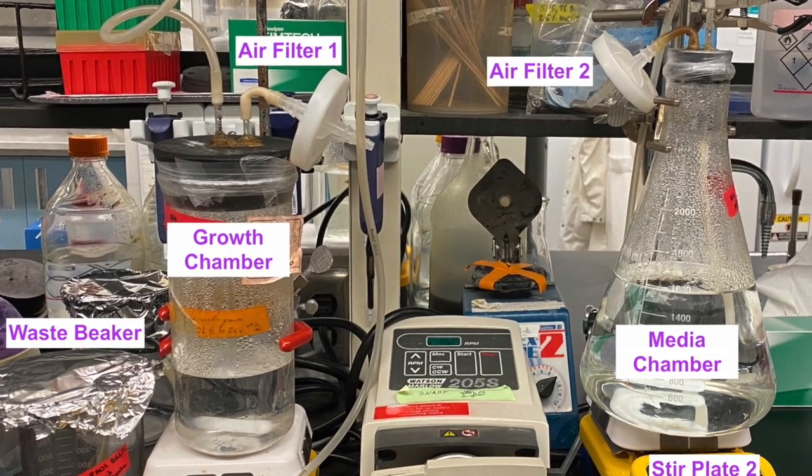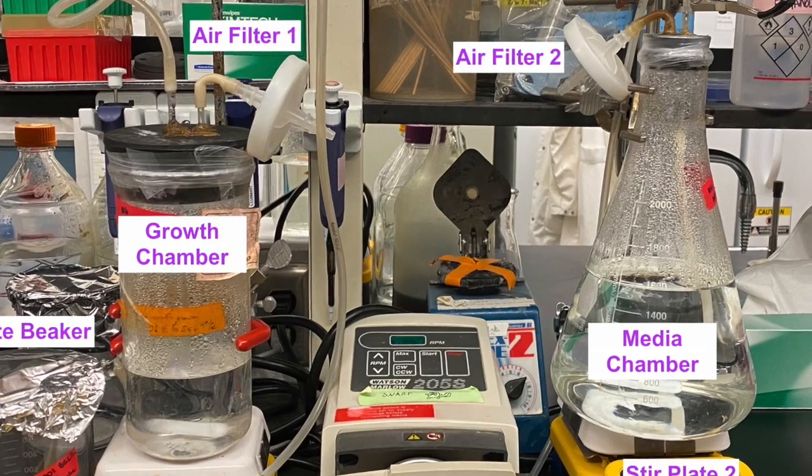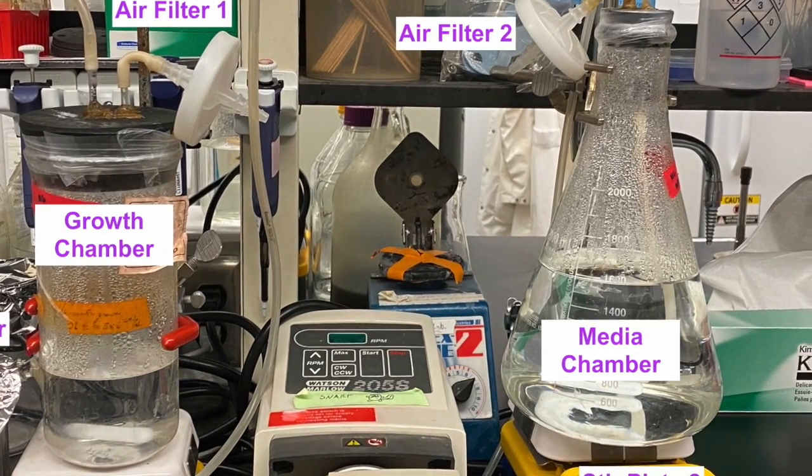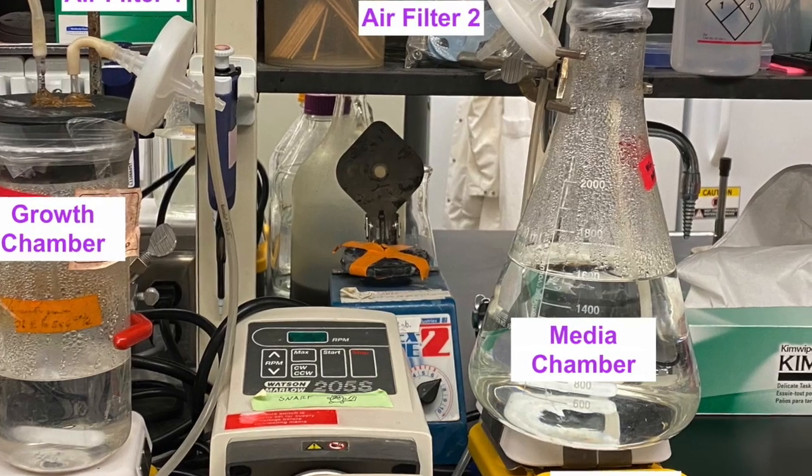Next we have the media chamber, where fresh liquid media is constantly being added. Notice there is no bacterial growth in the media chamber. This is a sterile environment.